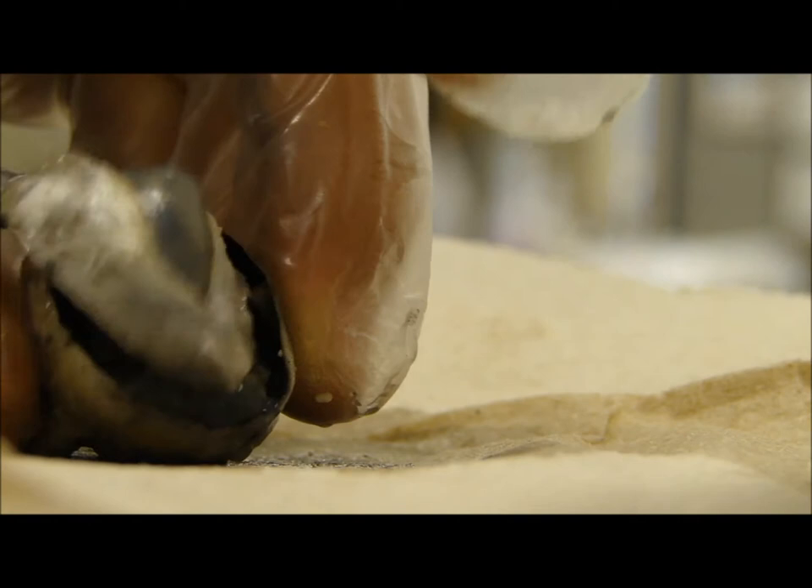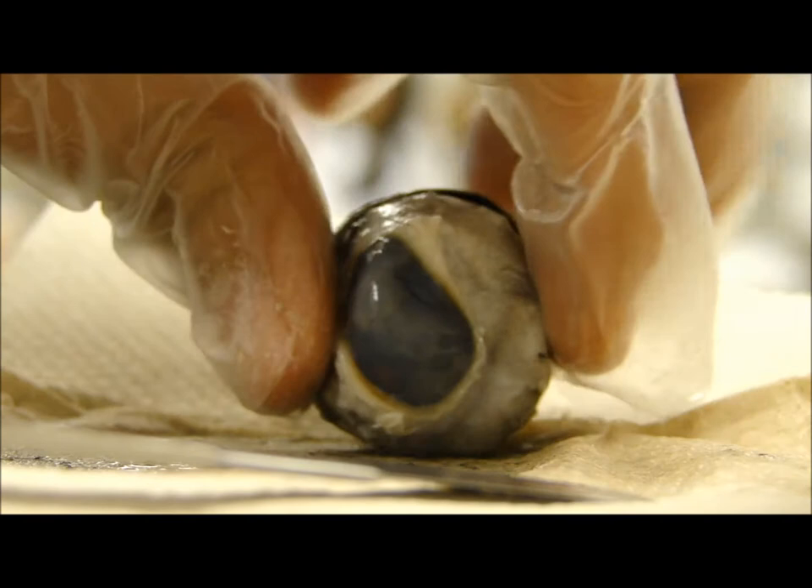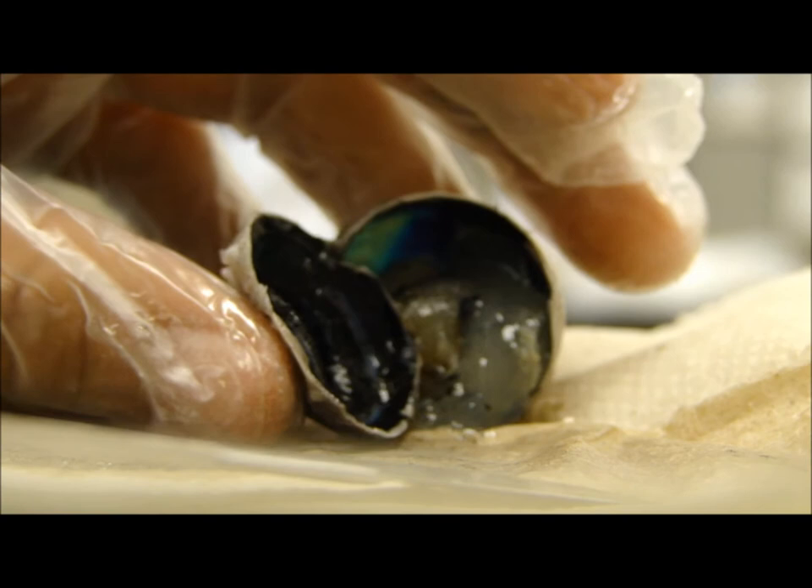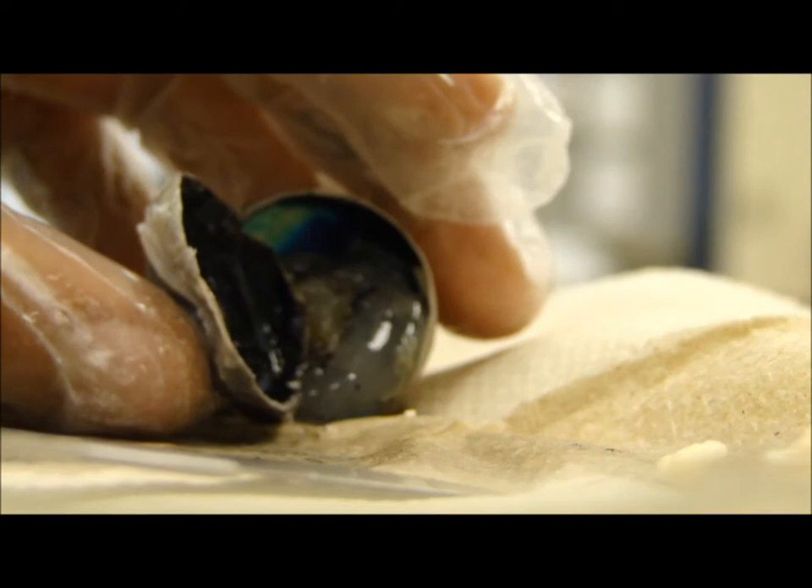Is it still focused? Yeah. Alright. The vitreous humor — the round thing in the middle — you can let that slide out. Okay, gross.